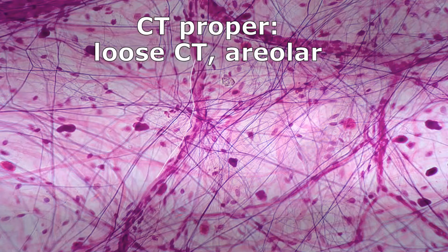This big, thick pink rope, that's your classic collagen fiber, and you can see it over here, high tensile strength. A lot of little black snakes, those would be the elastic fibers, going to allow stretch and recoil. These balls are the fibroblast nuclei, the cells that are creating the fibers, and the white in the background, of course, is the matrix, or the ground substance. Remember, the function of this is protection, act as bubble wrap, and the location would be wrapping the organs.